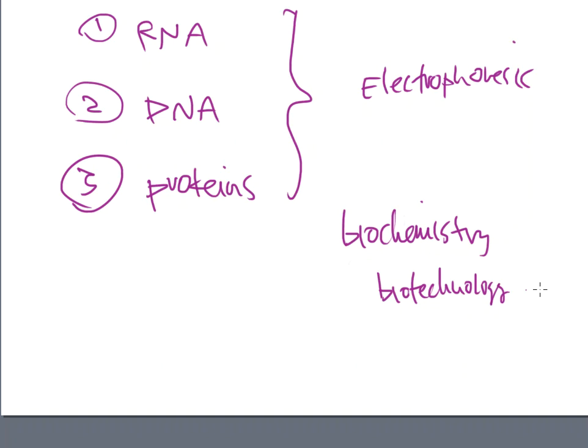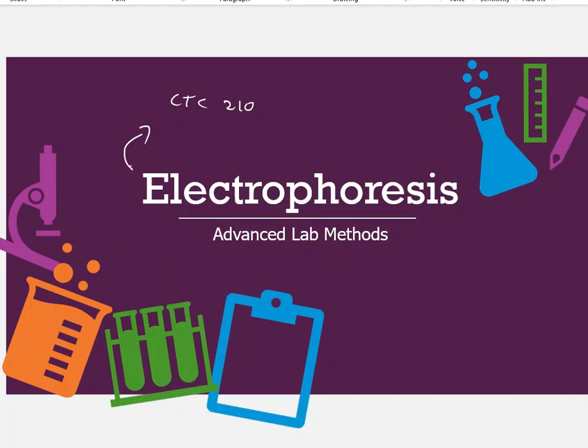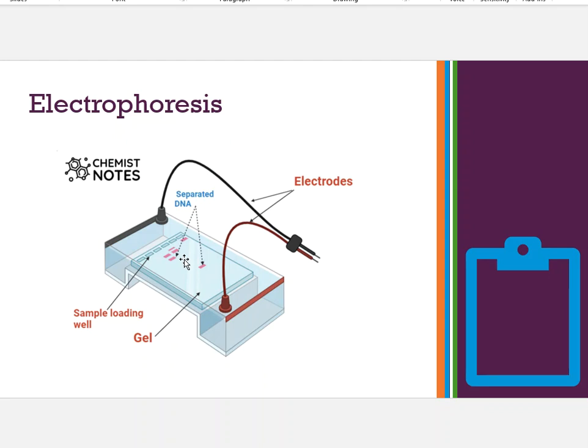So with that said, this is your introduction to electrophoresis, and there is way more than that. There are majors on it that we won't be able to get into, but it's my job to give you the basics here. That's what this is all about. All right, let me take a look at maybe a better diagram of an electrophoresis chamber. And the electrophoresis chamber is going to look something like this.